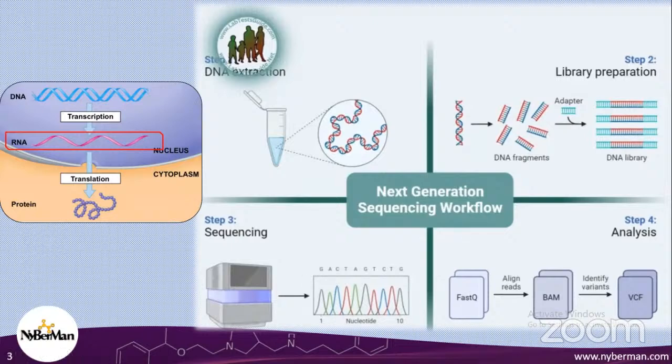Some sequencers are able to give long reads, and some are able to read only short RNA or DNA sequences. So based on the sequencer, our data depends on what type of data we are going to get from our sample, because from the same sample, if you use a different sequencer, you may get varied data in your raw data file, which is in FASTQ format.